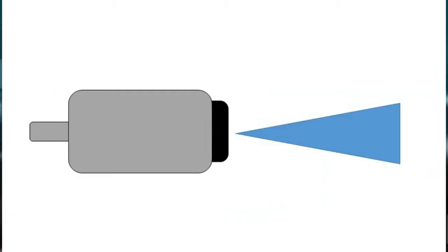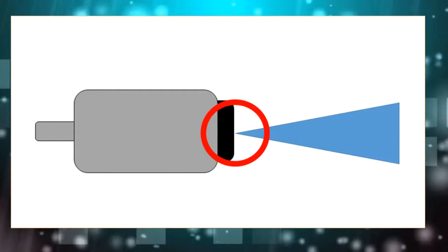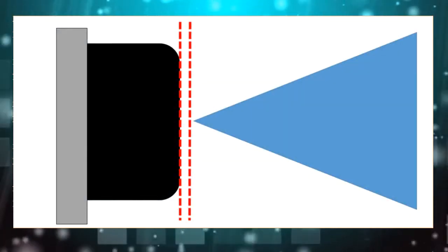By visual, the sample and the tip seem to be in contact. However, they are not if we zoom into the portion. From the diagram, the space between the sample and the tip is very small. Only then can tunneling work.